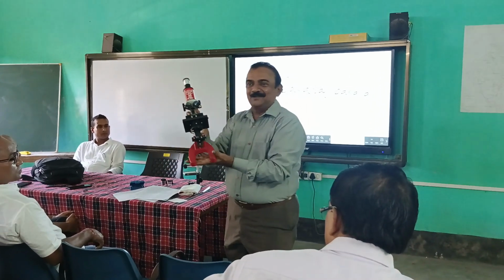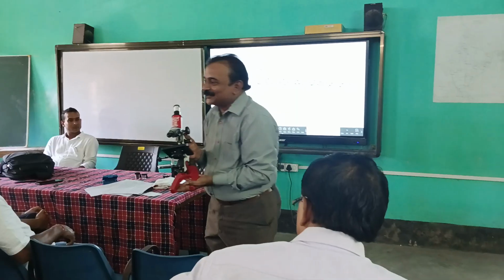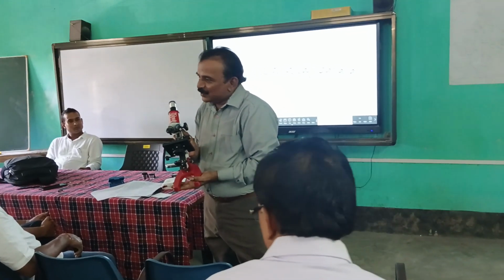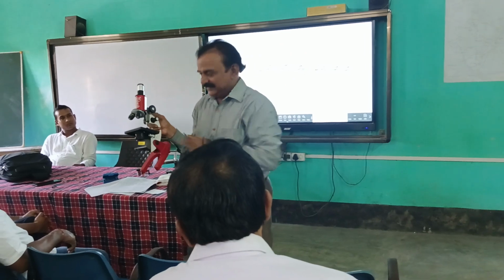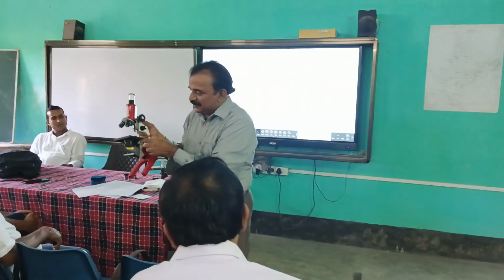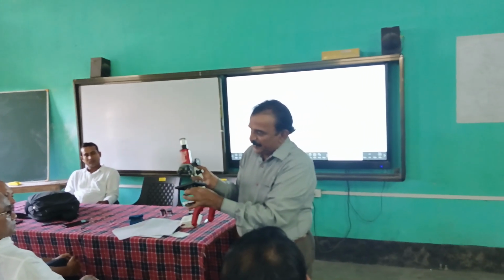So I told you all the parts of the microscope, and now please say, is your microscope working or not? Working. It works. Jaya, it works. But the only thing is, the diaphragm is closed. Just below the stage, you see, friends, our diaphragm, and it is closed. Open it. Here the lever is there, and you can open and also close.